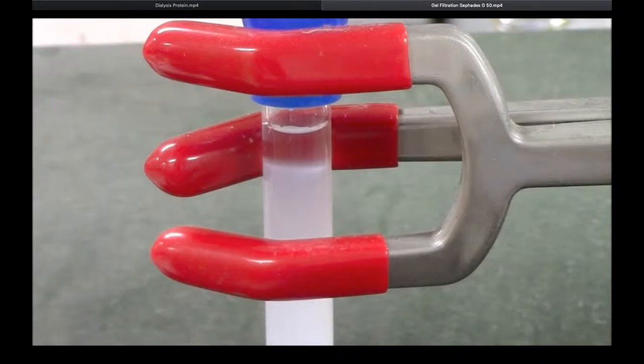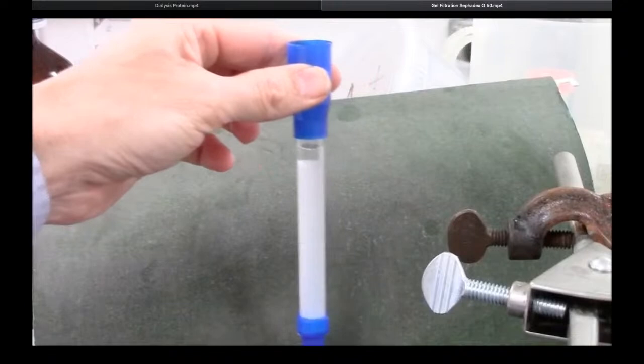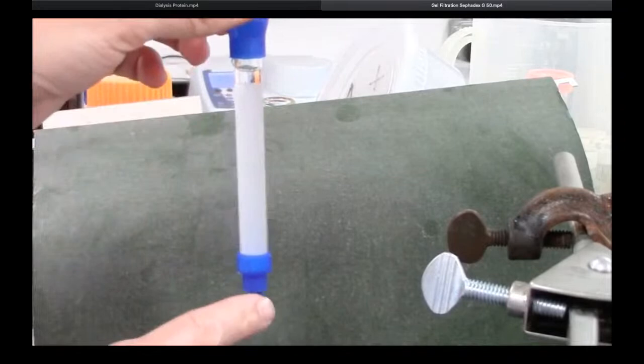Gel bed is right here. I'll add a little more buffer so that it doesn't run dry at the top. So I'm gently adding a little buffer to the top. This looks great. You can see the gel bed is fully settled here. There's a little bit of buffer on the top. I've capped the bottom right now to keep it from going dry.